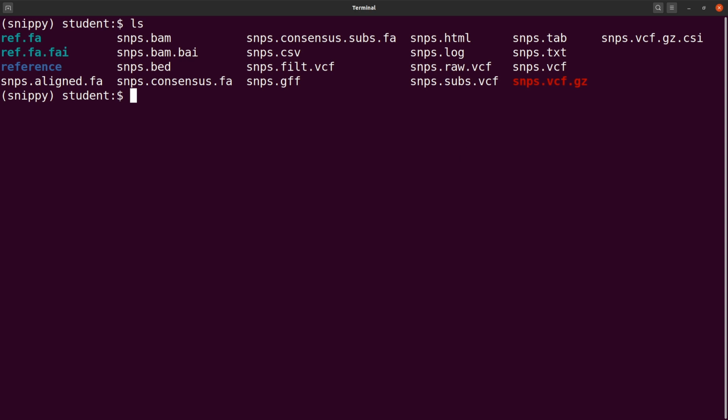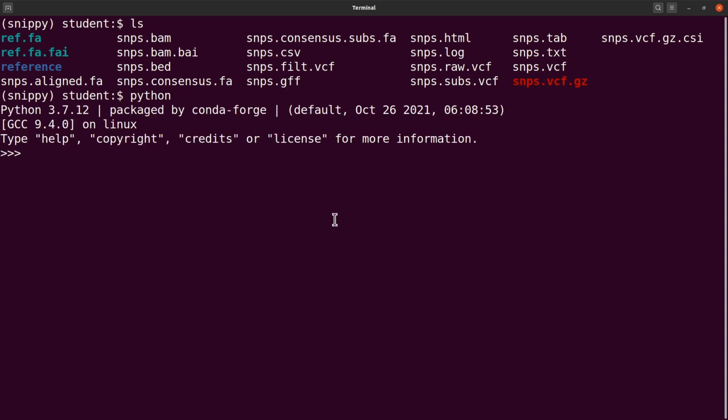So let's proceed. Now, let's look at how we can use Python to explore the information that can be found here and then here. You can use R, but I'll use Python to do this, and it will also be an opportunity for me to introduce you to some Python libraries. So let's call Python. Python is part of the tools we installed. If you use the YAML file, then Python is already installed for you. So let's run it. We have Python here, so we are good to go. With Python, we can use some libraries to open CSV files and this file here.